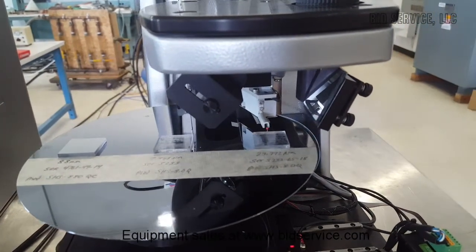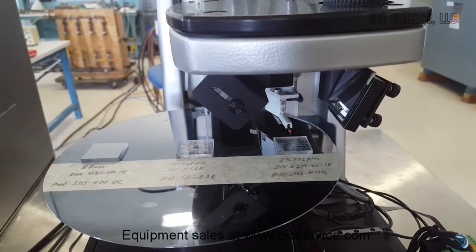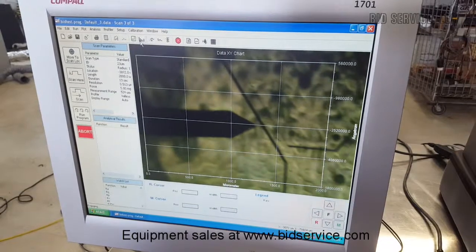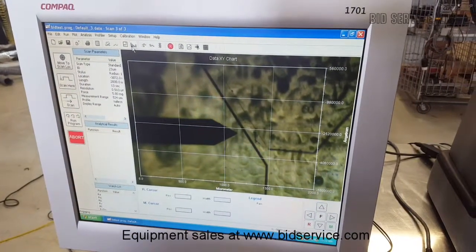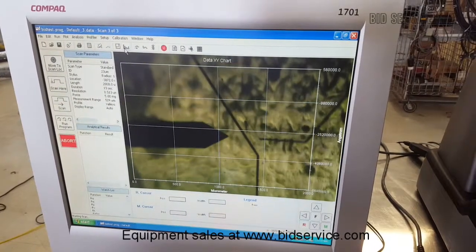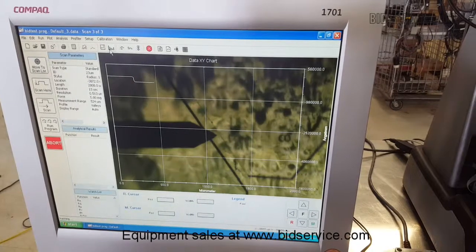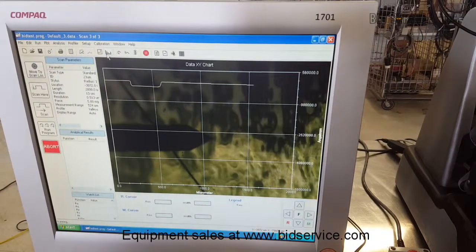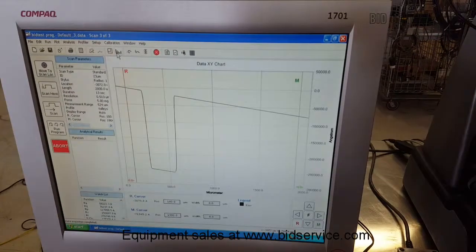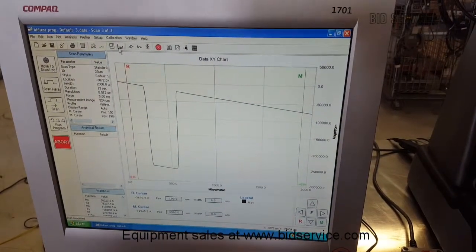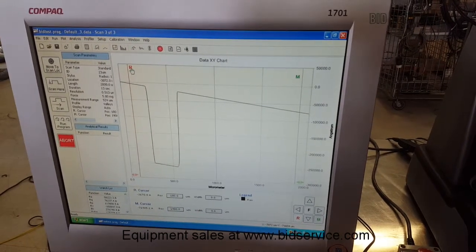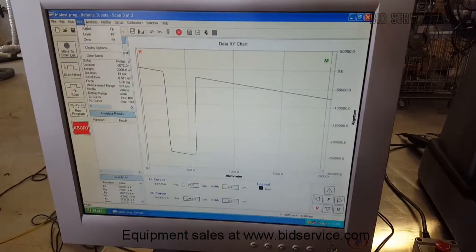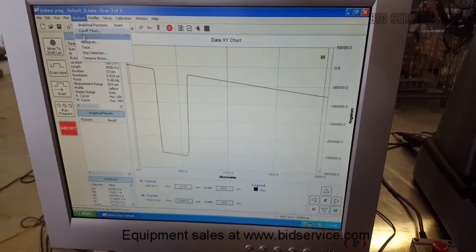The third standard is 23.772. So once it's done performing the scan, you can come to plot, and after you set your cursor up, you can level the plot.